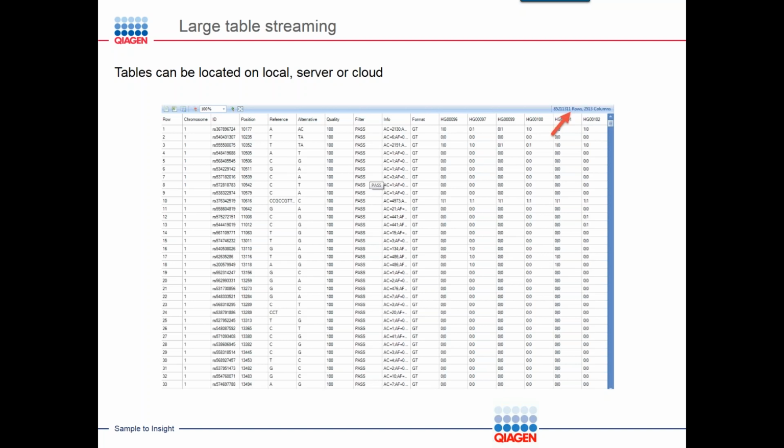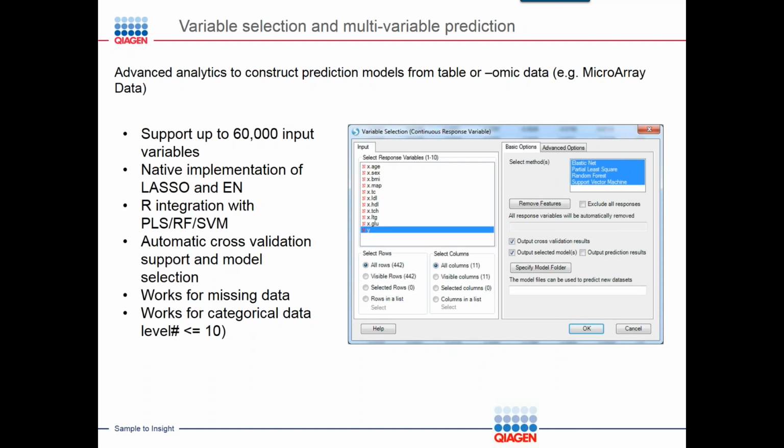So this one combined with annotation, which essentially is OSCR streaming, actually provides the user a very fast way to filter millions of variants or hundreds of millions of variants into a few variants.